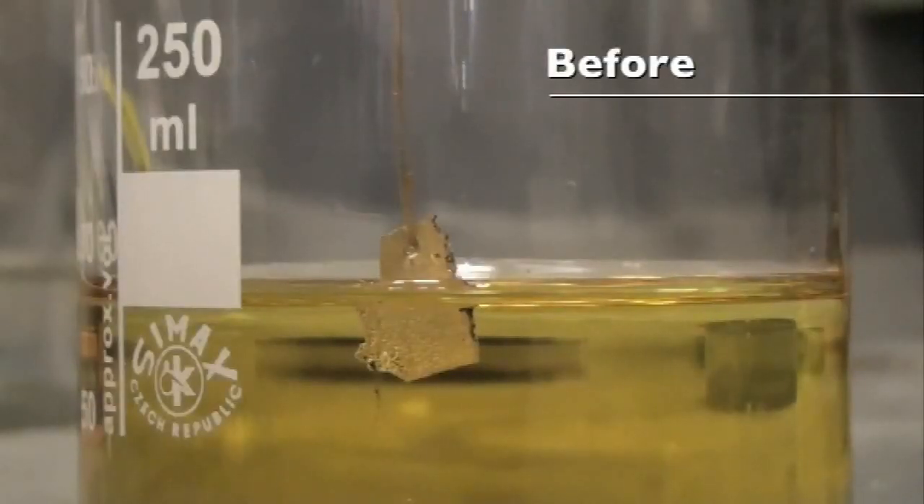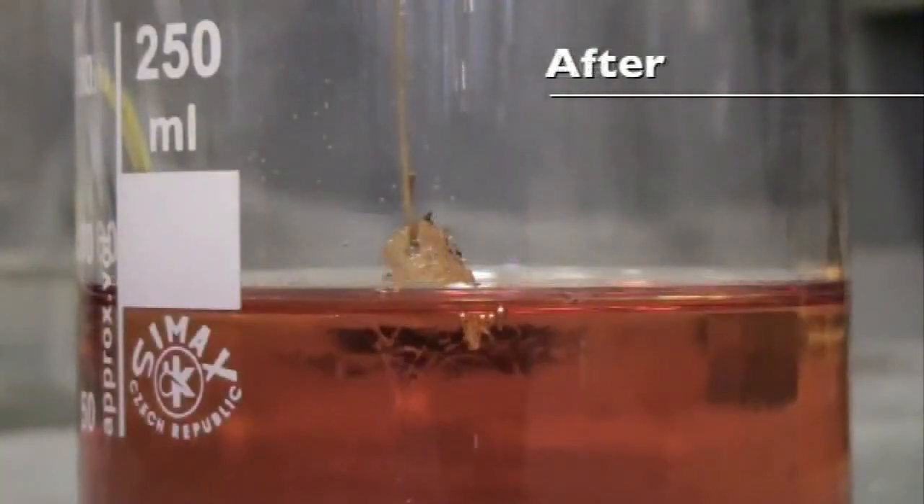I've never seen aquaregia because it's quite a nasty material. You have to use it in a fume cupboard because of the fumes of NO2. Unless you want to dissolve gold, you don't usually need this. It is a pretty good cleaning material if you have glassware, beakers, things like that, that you can't clean any other way. The sort of last resort is, we'll try aquaregia, see if that'll do it — really bang the dirt. And it sometimes works, not always; depends what the dirt is.